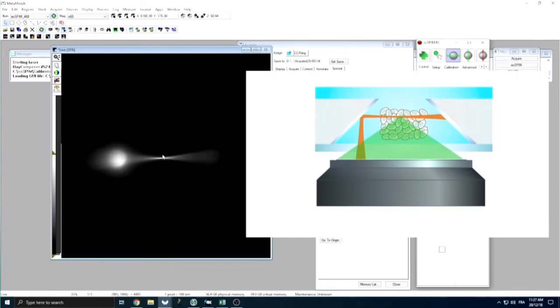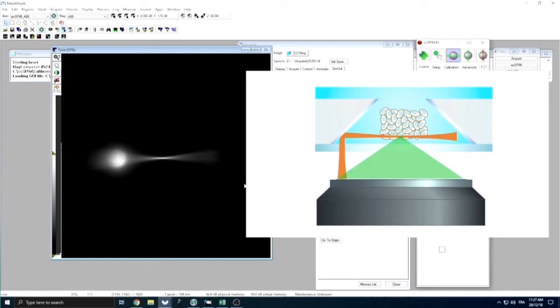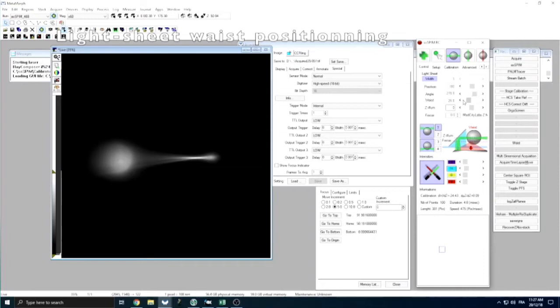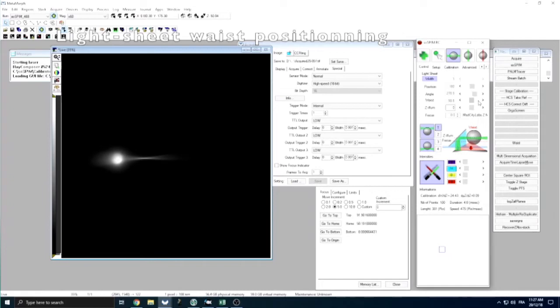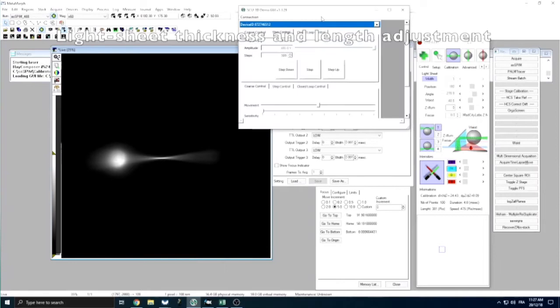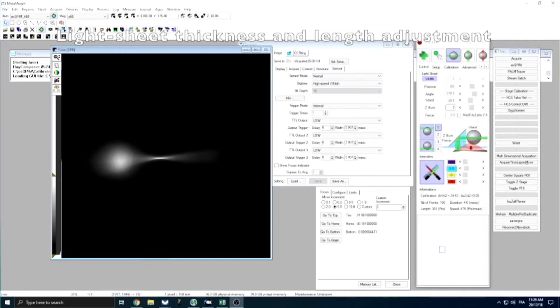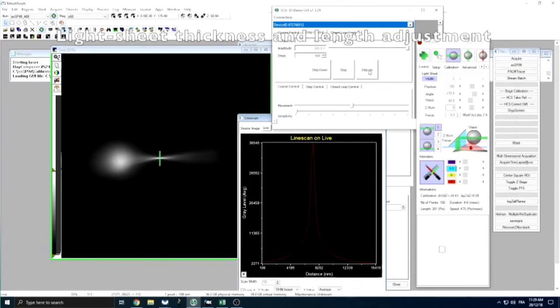It is this waist part that we will have to move in 3D simultaneously and synchronously with the image plane to perform optimal 3D imaging. Before the synchronization process, let's review some features of the SOSPIN beam steering unit. First, we can control the position of the light sheet relative to the mirror, to localize its waist at the sample position, by adjusting the waist scroll bar in the SOSPIN software — it moves the waist part of the light sheet closer or further from the mirror. Second, we can adjust the light sheet parameters such as its thickness and length using a motorized iris in the optical path to change the laser beam diameter, allowing us to create light sheets with a thickness from 1 up to 5 micrometers and a length from 10 to almost 300 micrometers.